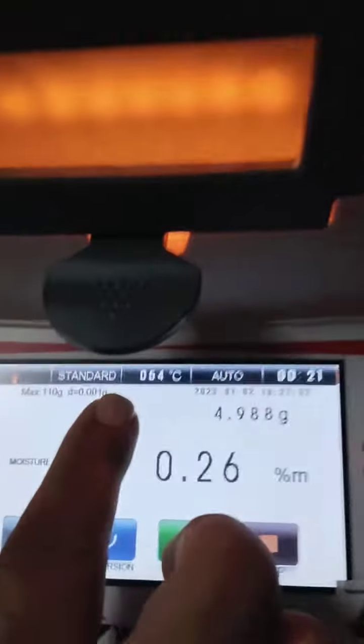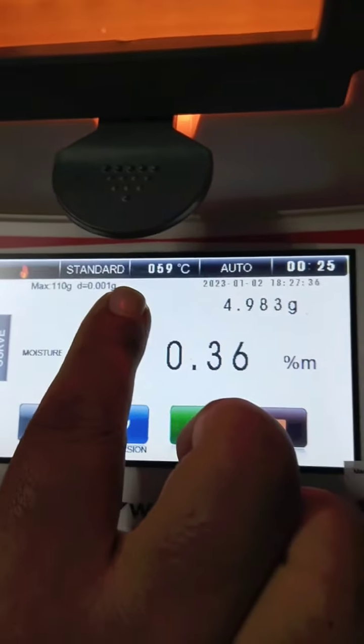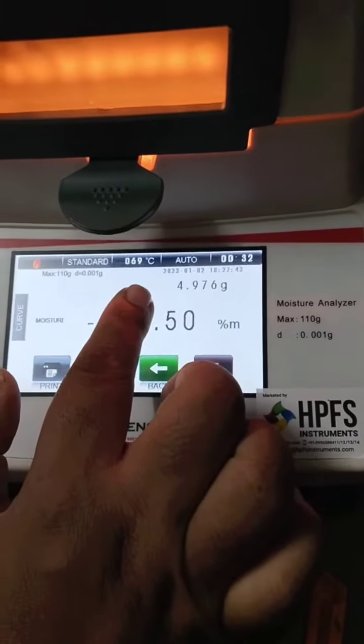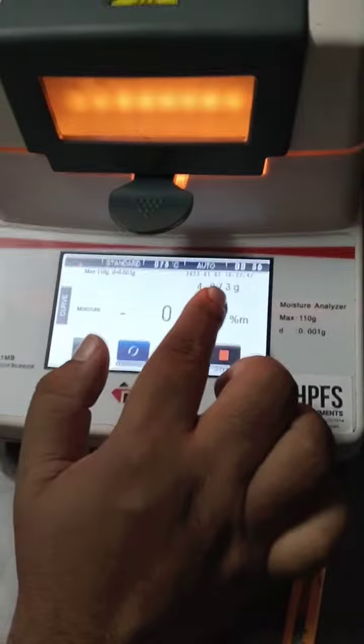It will reach 110 degrees. It can be changed accordingly with the test. Now we have to know exactly what temperature is needed. We have to keep 110 degrees as standard.